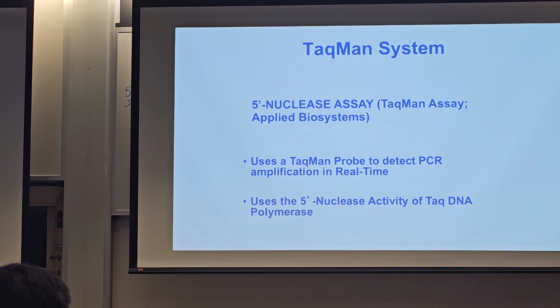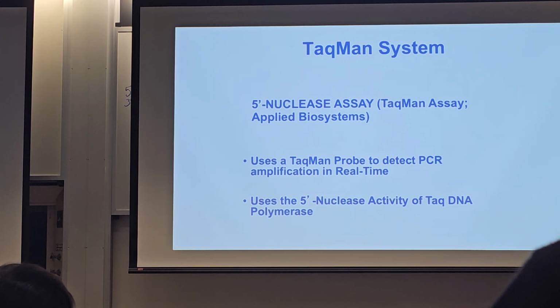Well, typically when you are doing gene expression studies, so for example in our experiment we're doing PCR, the whole mouse genome sequence is known, the sequence of the TTR cDNA is known. You need to have that information before you can design an experiment like this. Okay, so for a lot of the common organisms, this isn't an issue.